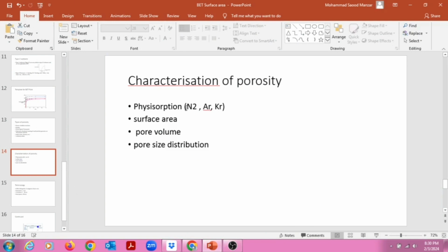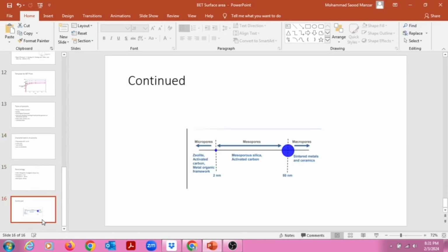As I told you earlier, we know a term called total surface area, which is specific to the external surface, while the BET surface area is calculated with the whole surface, such as the surface of pores and the external surface of the material, and is calculated by the adsorption of nitrogen gas on the surface of the material. And we already saw these terminologies.